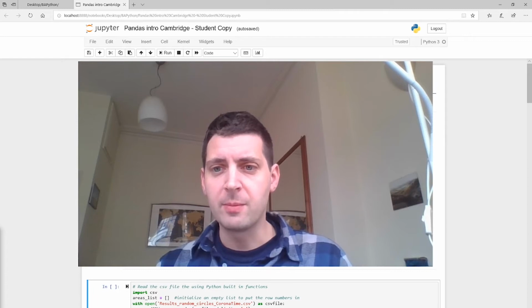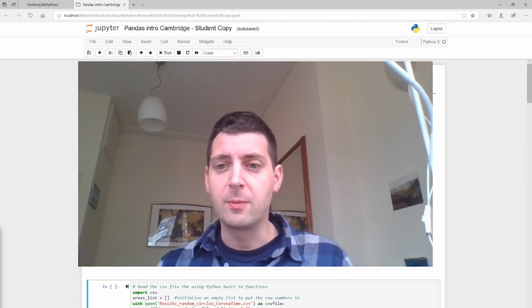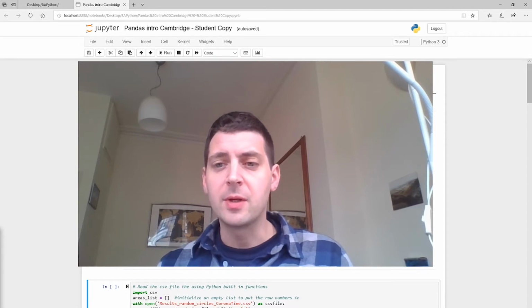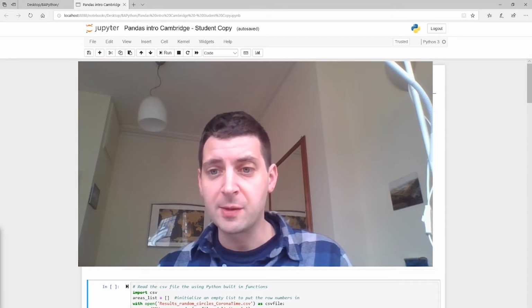We've set up our Jython script so that we can now use FIJI to look at our image of our simulated cells or random circles, and we can detect how many cells or circles we have, the size of them, the area, and we can export that into a CSV file. Now what we want to do is work with Python and some built-in libraries so that we can open the CSV file and explore the data and do some basic data manipulation and plotting.